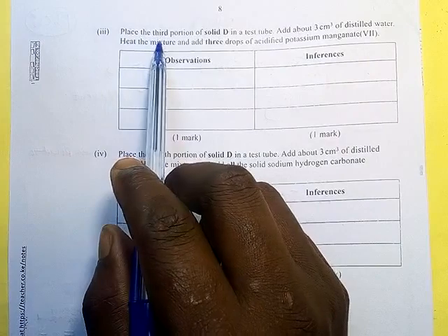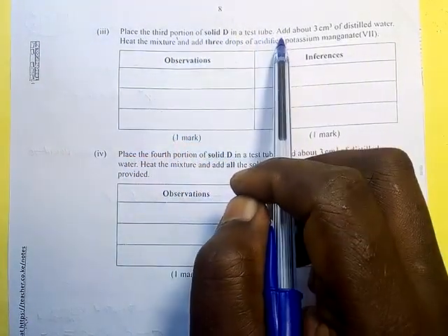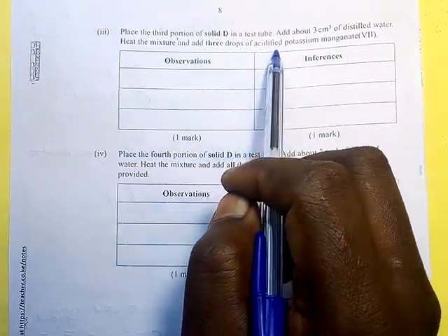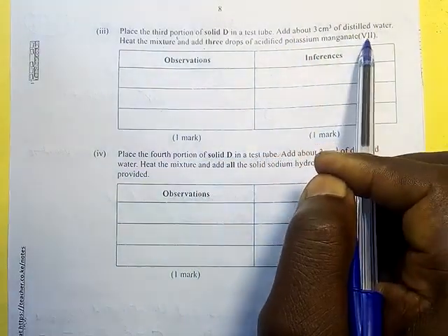Number 3, place the third portion of solid D in a test tube. Add about 3 centimeters cube of distilled water. Heat the mixture and add 3 drops of acidified potassium manganate 7.